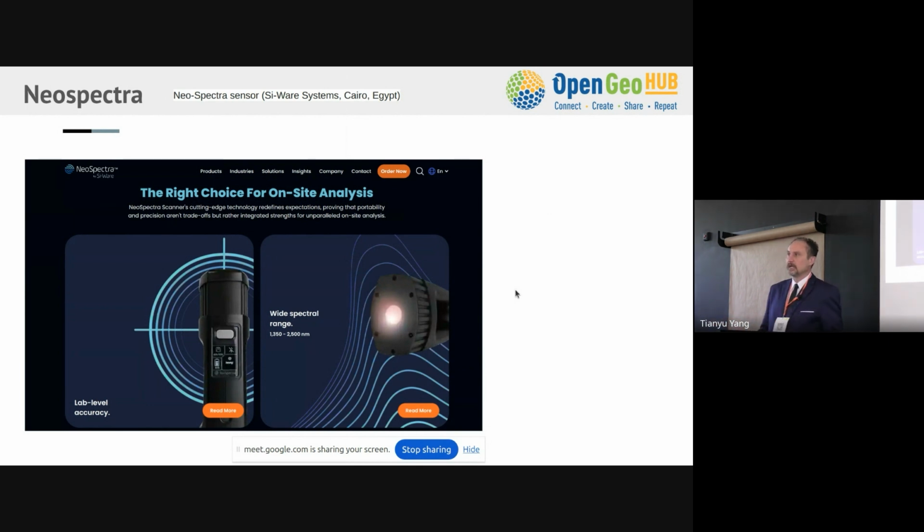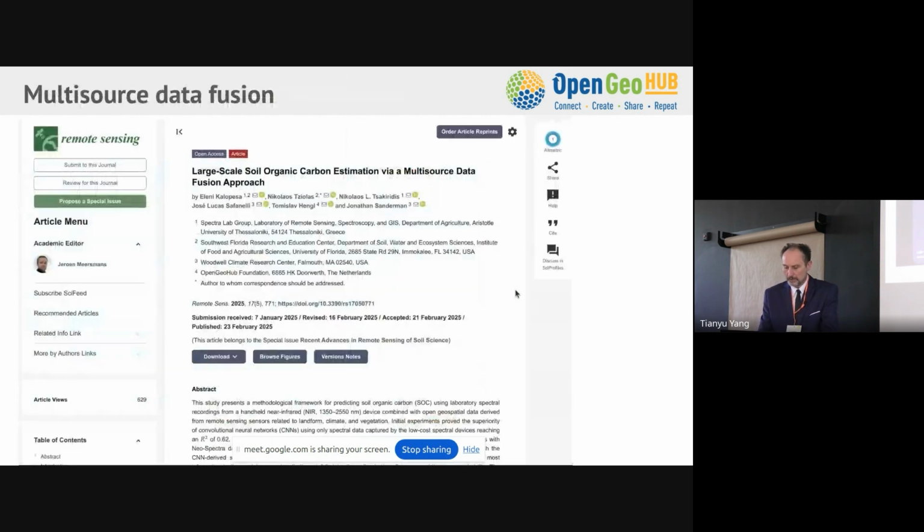They finish scanning, for example, 1,000 samples, and then they say, here are all the scans. Some samples they scan multiple times, and then you average to smooth out this short-range variability a bit. And that's how they produce it.